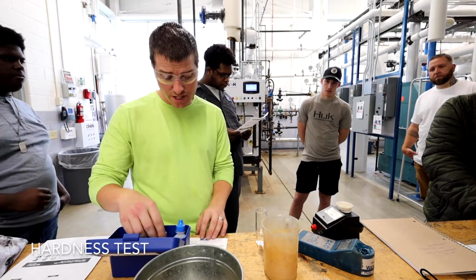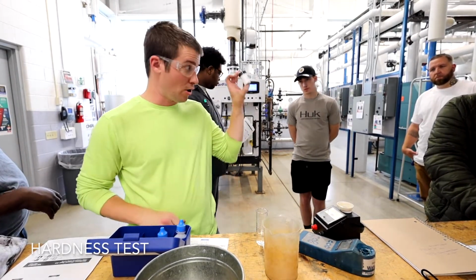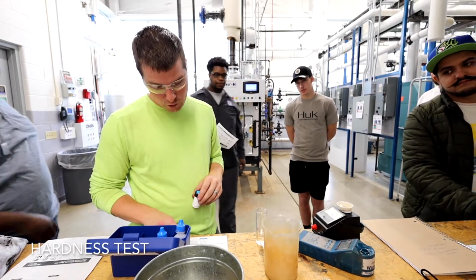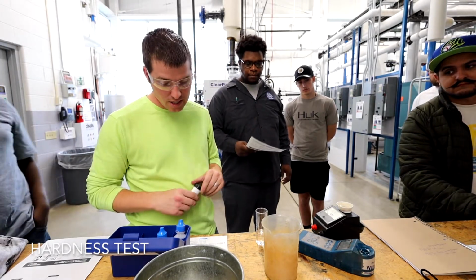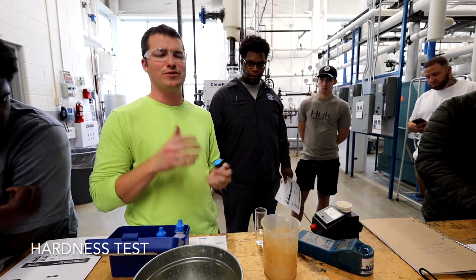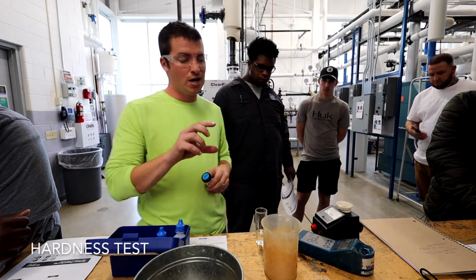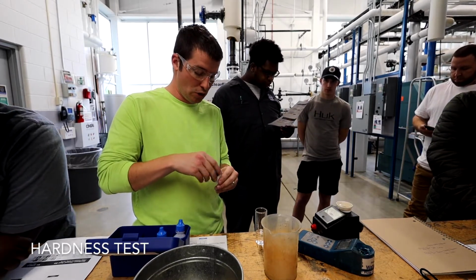Then we'll go to step 3. Add 1 scoop of our hardness indicator powder, and swirl to mix. The sample will turn red or purple if there's hardness present, blue if there's no hardness, right? So if it turns a really pink color, in my opinion, you have hardness. If it turns a pretty deep purple, you have a little bit. And if it turns blue, you know you have none.